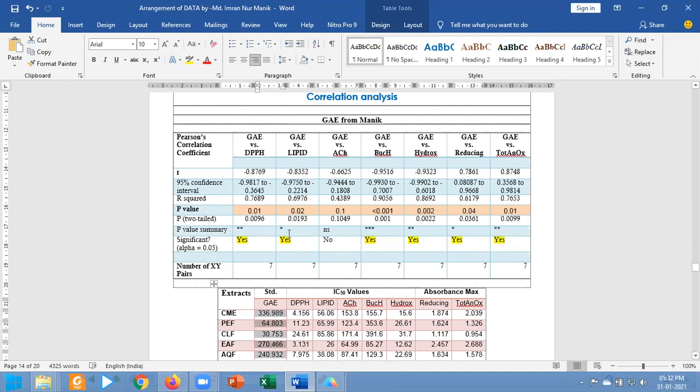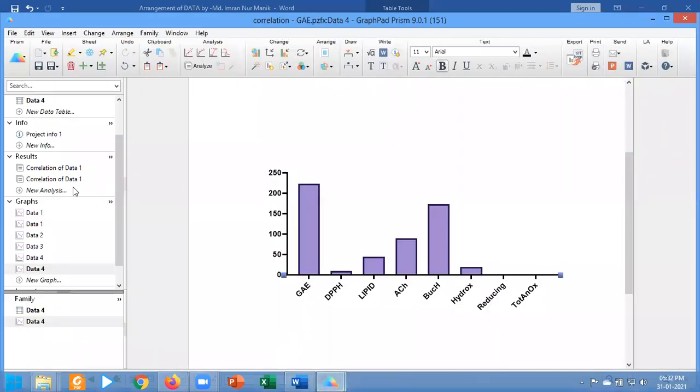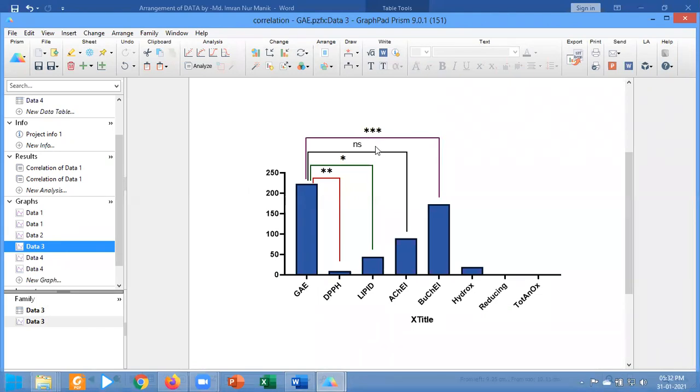Now I am going to show this correlation within this graph. I have already done one graph. So this is my graph. In this graph I was previously working with this to allocate the significance level.